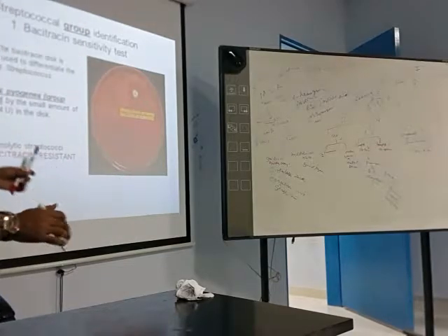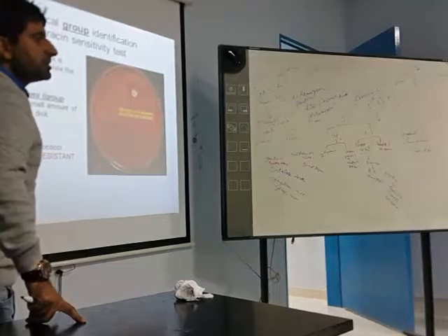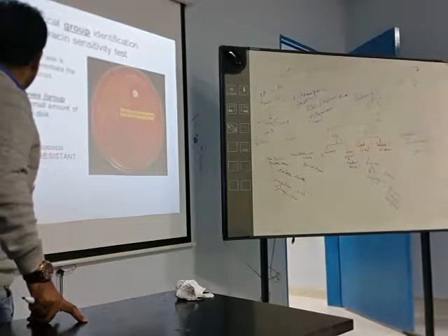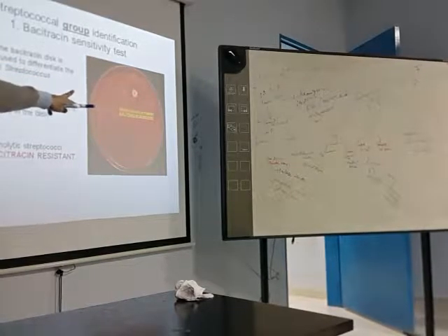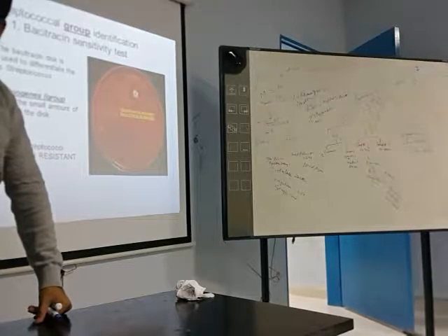It's a sensitivity test. In Streptococcus pyogenes, its growth is inhibited. This means it is sensitive to bacitracin, while all other beta hemolytic Streptococcus are bacitracin resistant. This is the principle. If this culture plate comes in the exam, you will say it is a bacitracin test.